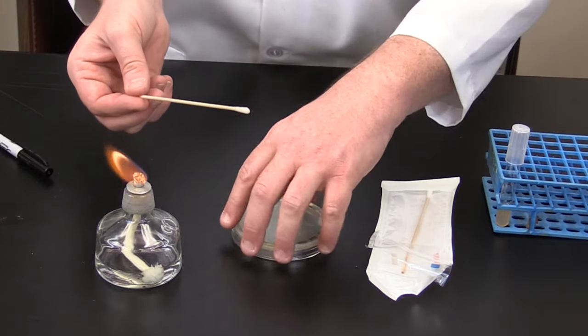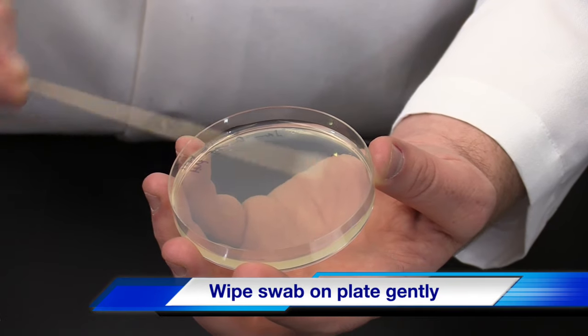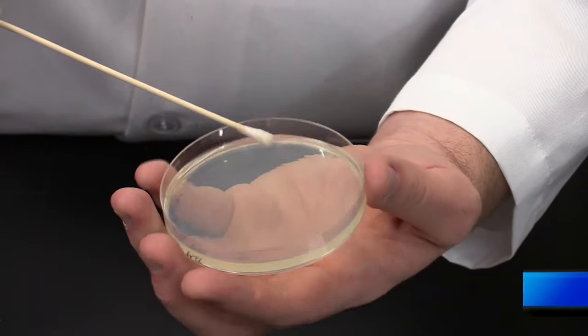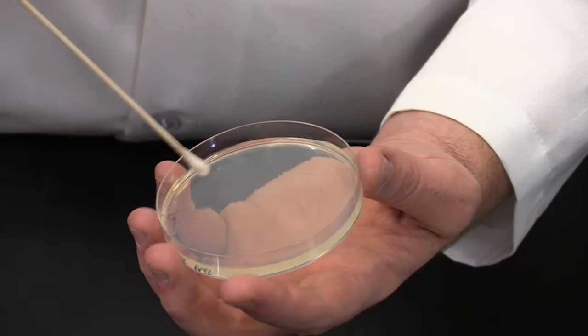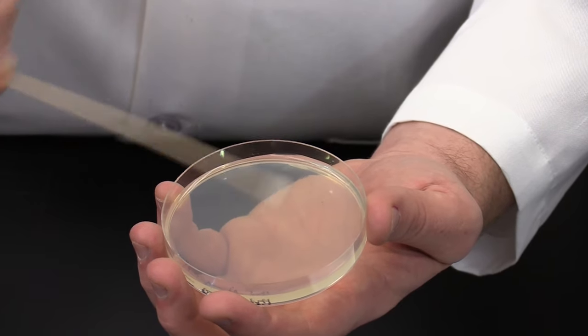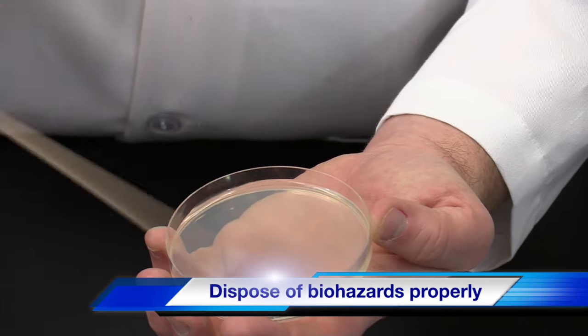Next, pick up the plate and using the swab in a side-to-side motion, swab the plate gently. The idea is to create a uniform layer of bacteria. To do this, slightly rotate the plate twice. When the entire surface of the plate has been covered, dispose of the swab in the biohazard container.